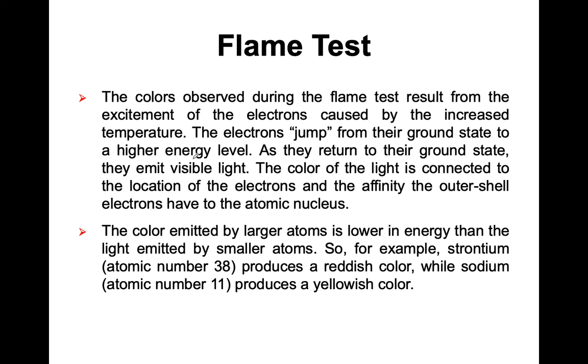In this lab, we will do 2 types of experiment. One is to measure the emission spectra of certain light sources, such as fluorescent light, LED, as well as neon, nitrogen, and hydrogen. And the second type of experiment is the flame test, which is easy and simply observes the color of the flame once the element source is put on the flame.